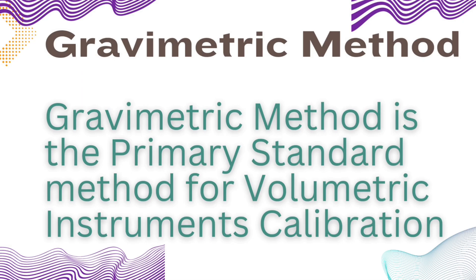Gravimetric method is the primary standard method for volumetric instrument's calibration.